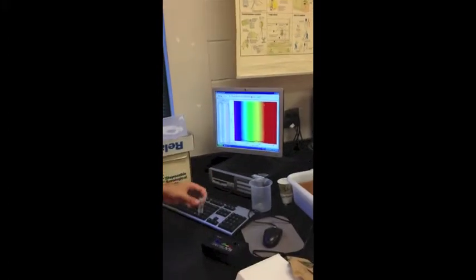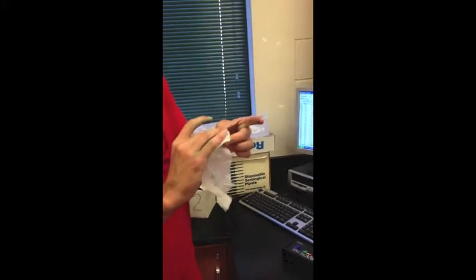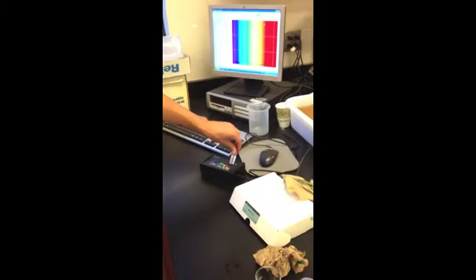Alright, nope, that's a little bit too much. It's a bit too little. Alright, so you can see this is not very colored. It just has a little bit of food coloring in it, but we'll see what we get. So, handy dandy Chem wipe. Clear edges.